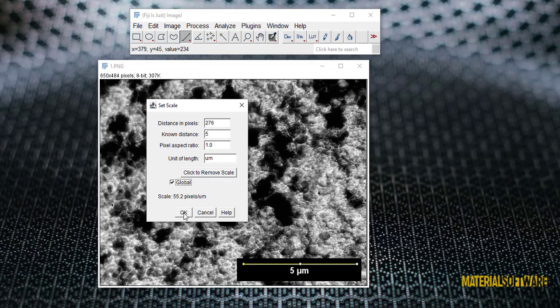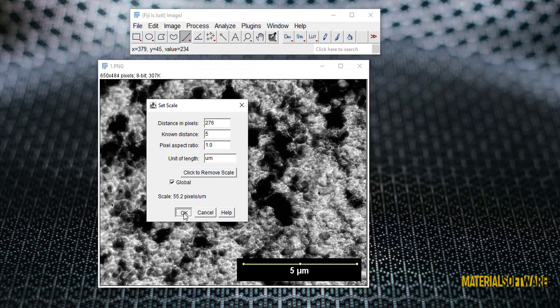You can see the global option — if this is ticked, so that you don't close the software, it will calibrate with the same scale for all the photos. But if you remove the global tick, it will be considered only for this photo.